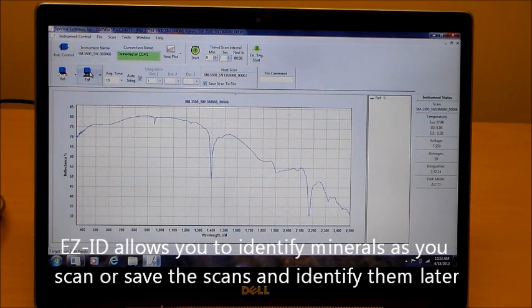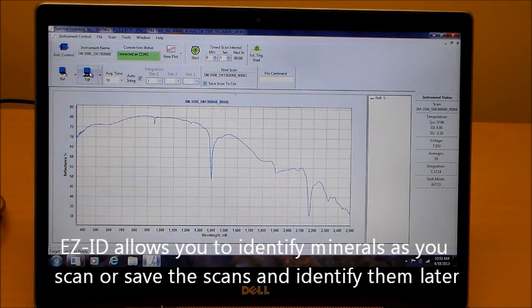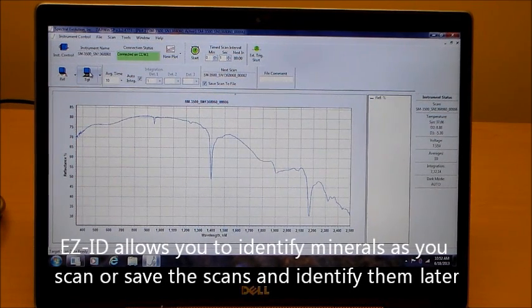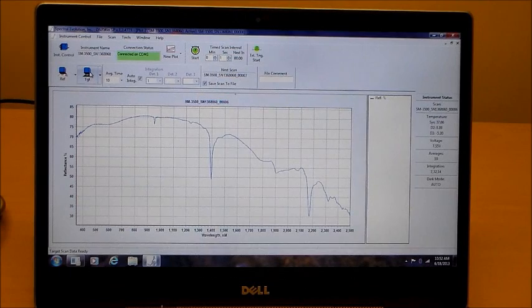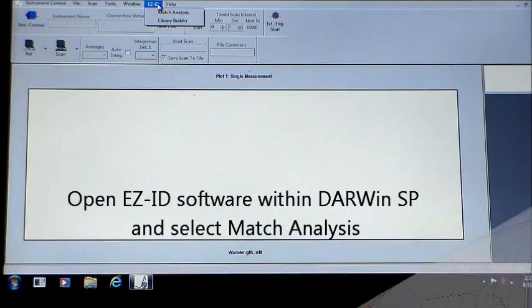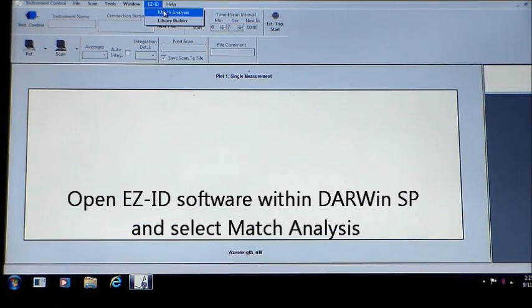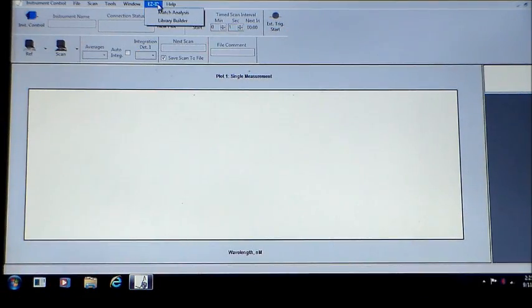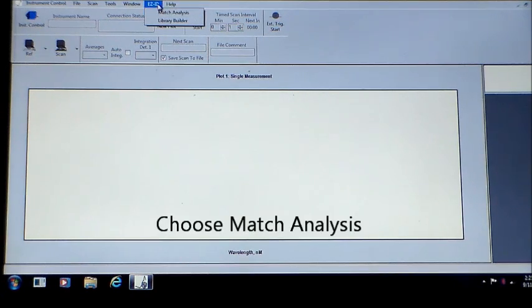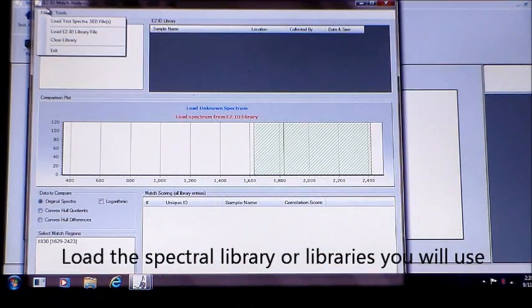When you run EZID on your laptop, you can identify scans as you collect them or save the files and identify them later. EZID runs from within the Darwin SP data acquisition software. Choose the Match Analysis option.